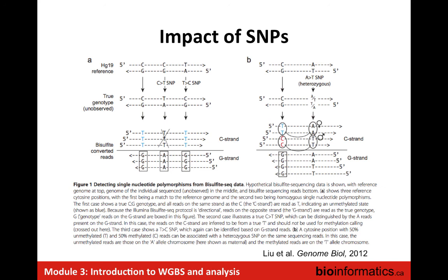Yes. So to solve that, could you use the reference-free method, and for every sample, sequence one that is bisulfite converted and one that is unconverted, so that you could see before and after conversion without comparing to a reference genome? So you could do that, but that would be quite expensive. If you were to do that, you might as well do a genotyping array, potentially, and then know these locations already, or sequencing, which is even cheaper. So you could know these locations using some other method, and then annotate these as SNPs separately. But the reference-free approach, potentially, would be another advantage.